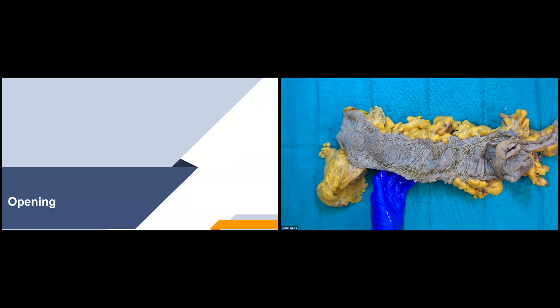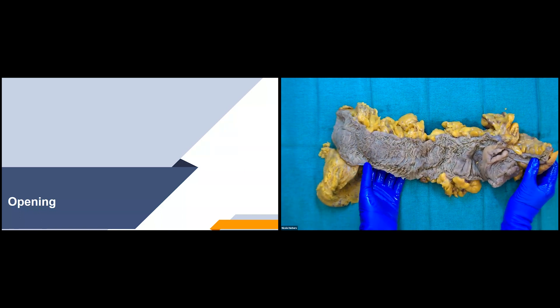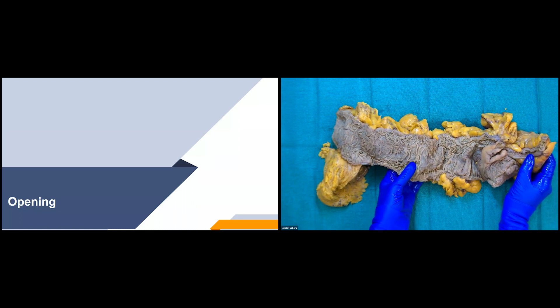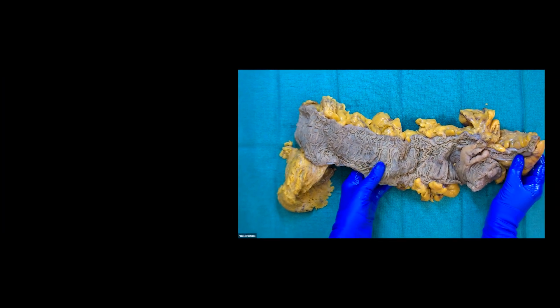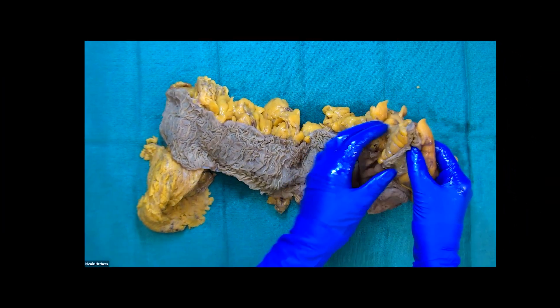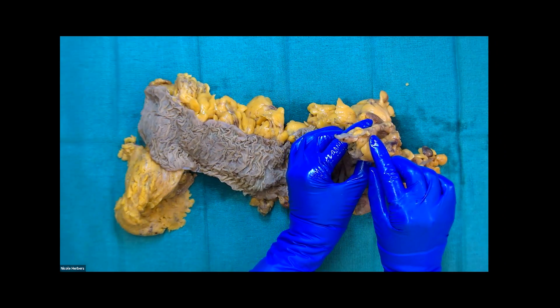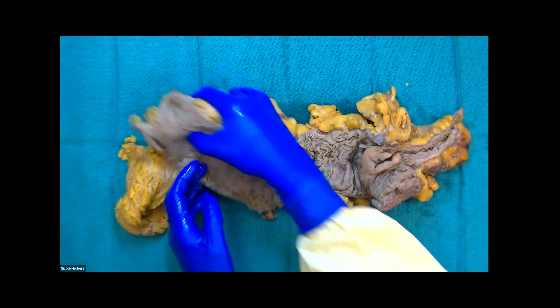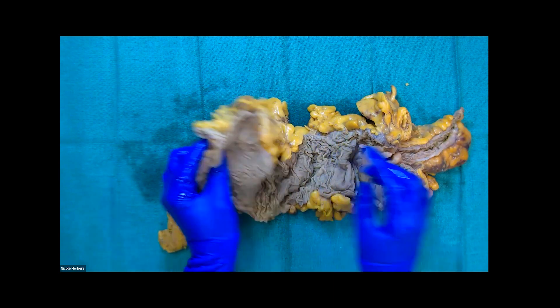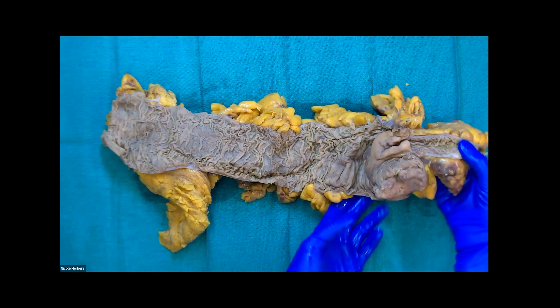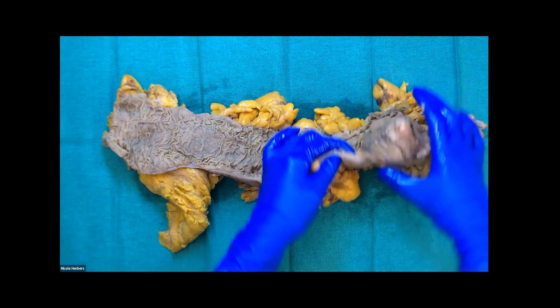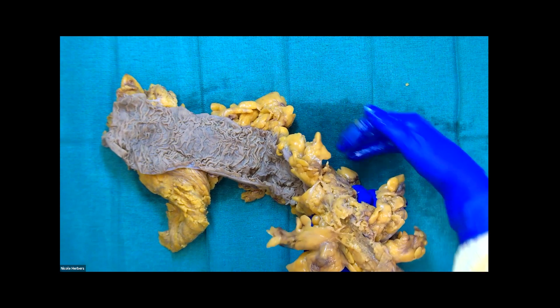Now we'll go through how to open these types of specimens — how we open them and why we open them. We open specimens to allow for formalin to enter the specimen so that it can fix properly and the tissue doesn't die and become necrotic on the inside. For colon cases, we want to hinge the staple lines, which will be at the end resection margins. Here's my staple line here that I've hinged, and here's my staple line here that I've hinged. Then I want to cut through my tenia coli, which I showed you a little bit earlier, this muscle band here.